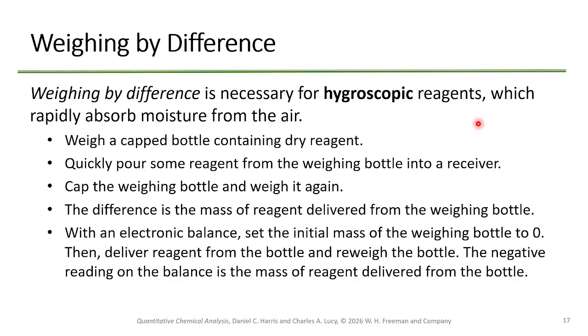Okay, so this will rapidly absorb moisture from the air. When you're weighing, a capped bottle will contain that dry reagent and keep the water from going in. Does it perfectly keep all the water out? No. So remember, whenever you're capping things, you have a headspace, right? So every time you uncap it, you're going to add that amount of moisture in. Okay? So you got to be really careful with these things.